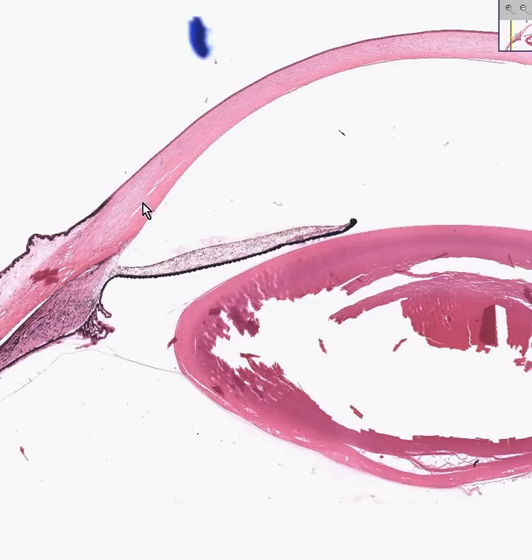And that consists of the cornea, which is the transparent part of the fibrous tunic. And then there's the sclera or the white of the eye, which is also fibrous tissue, but it's not transparent. Where the angle of the cornea meets the greater radius of the sclera, this is called the limbus.